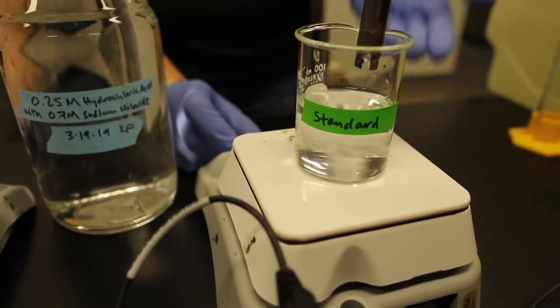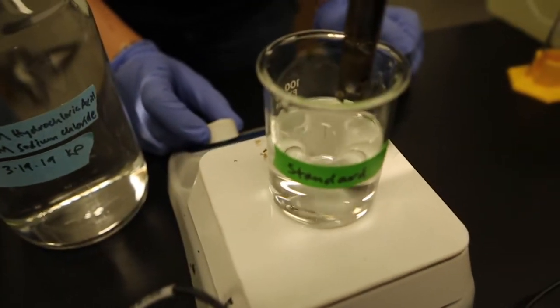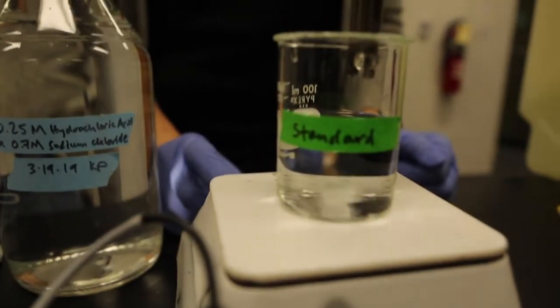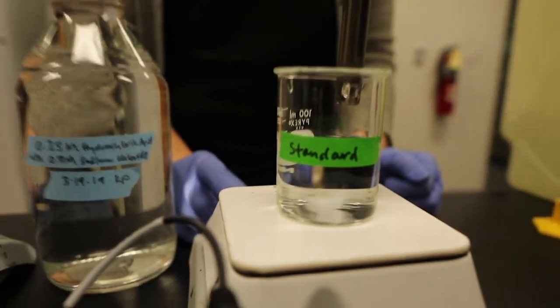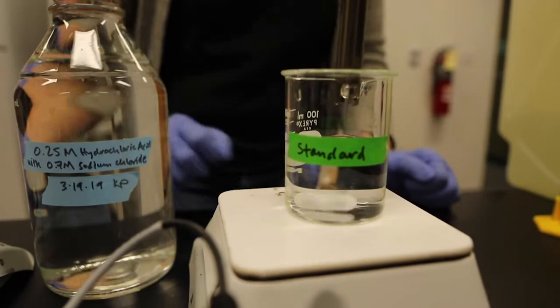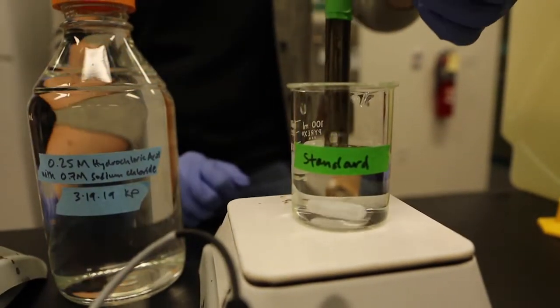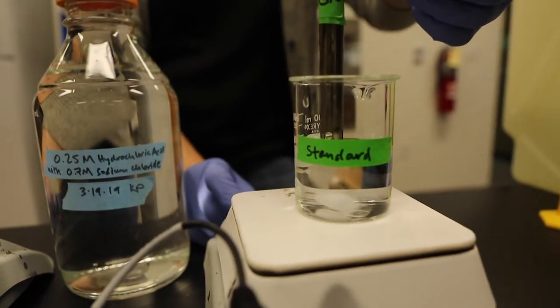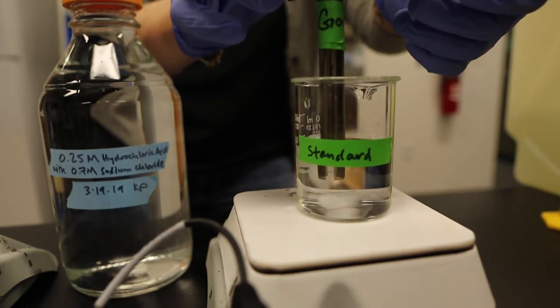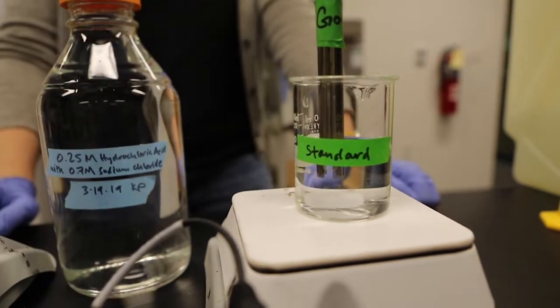If we sped it up, you could get a really strong vortex going, which is good mixing, but is not going to be great for the pH probe in there. So we're going to have it at sort of a medium speed, mixing well but without a vortex. And then we'll just adjust this to find the quiet spot. And then we're ready to carefully lower in our pH probe so that the tip is fully submerged but not running into that magnetic stir bar. So we should be good right there.